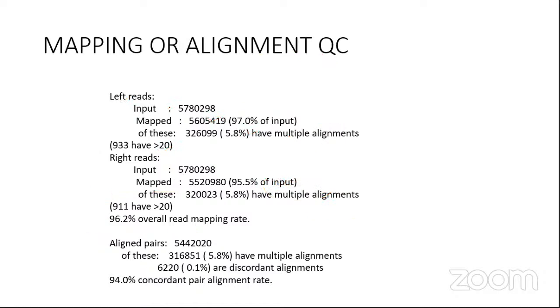So once we have done the alignment, we have some numbers. How are we sure that this alignment is good or not? It is a general phenomenon: if we visualize something, if we see something, we have more confidence.